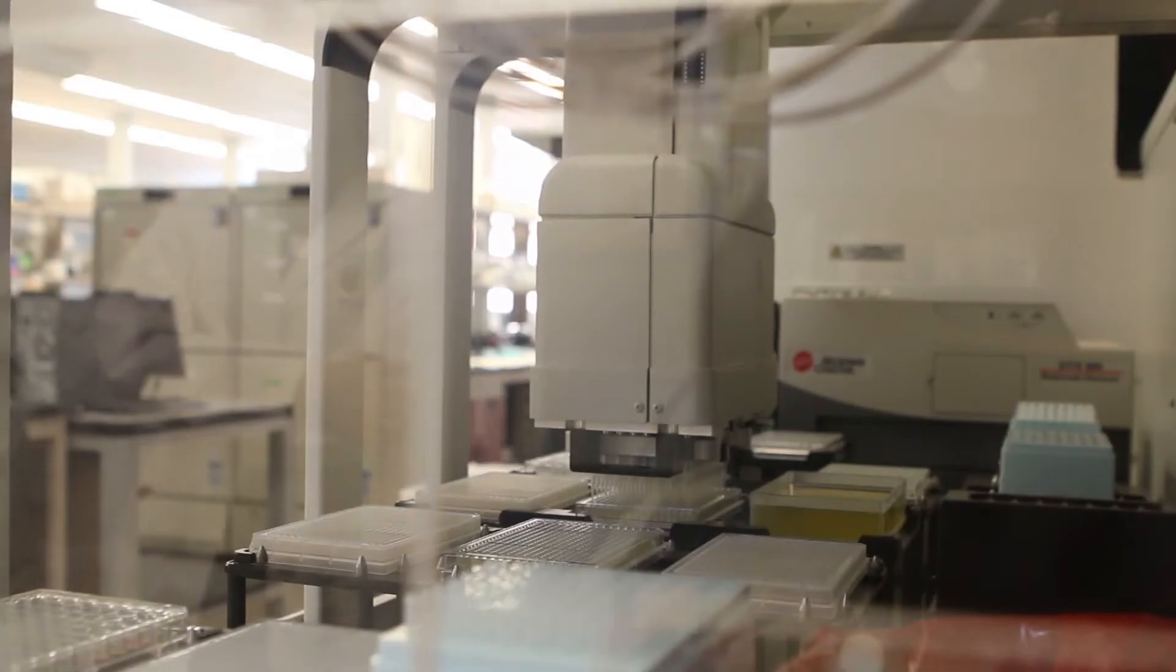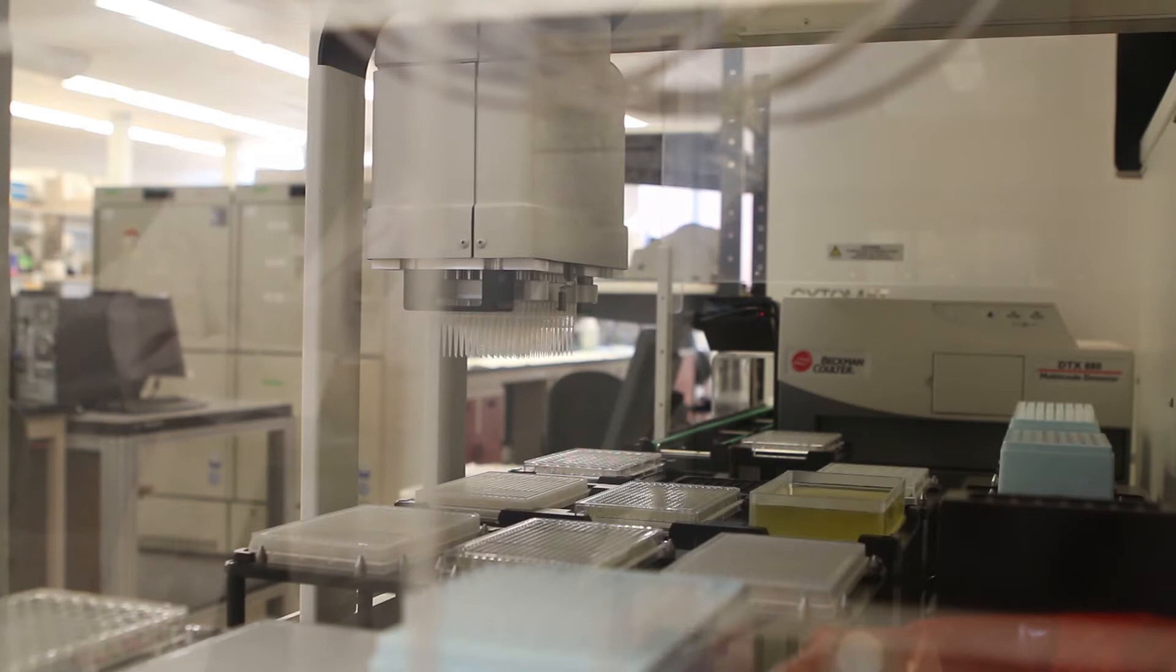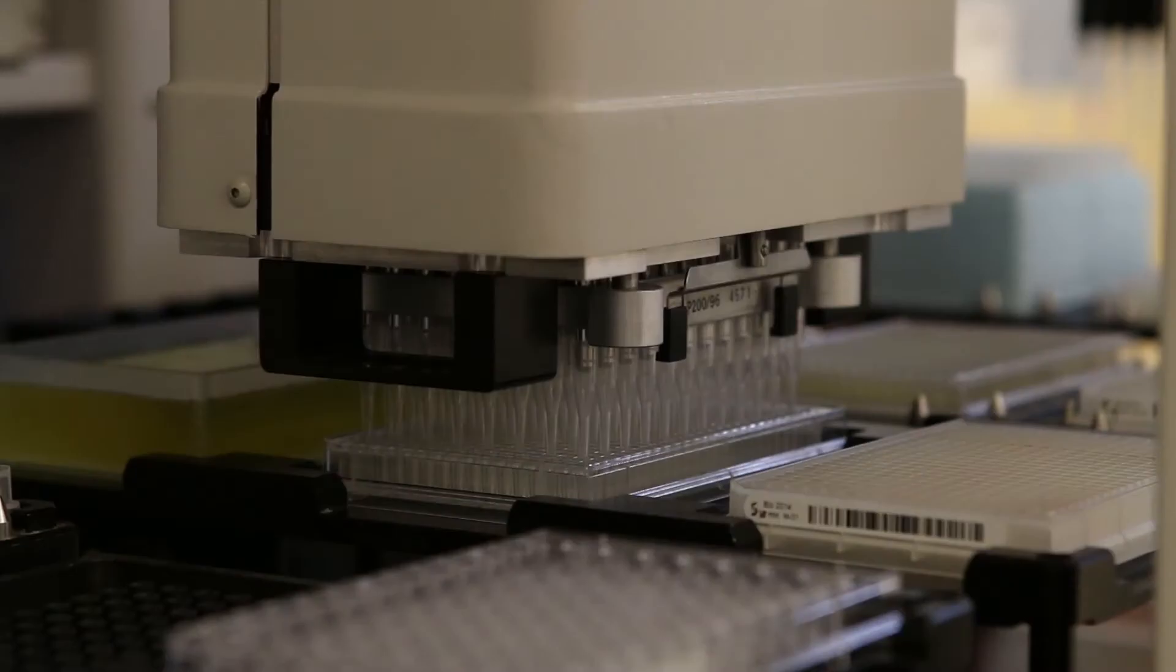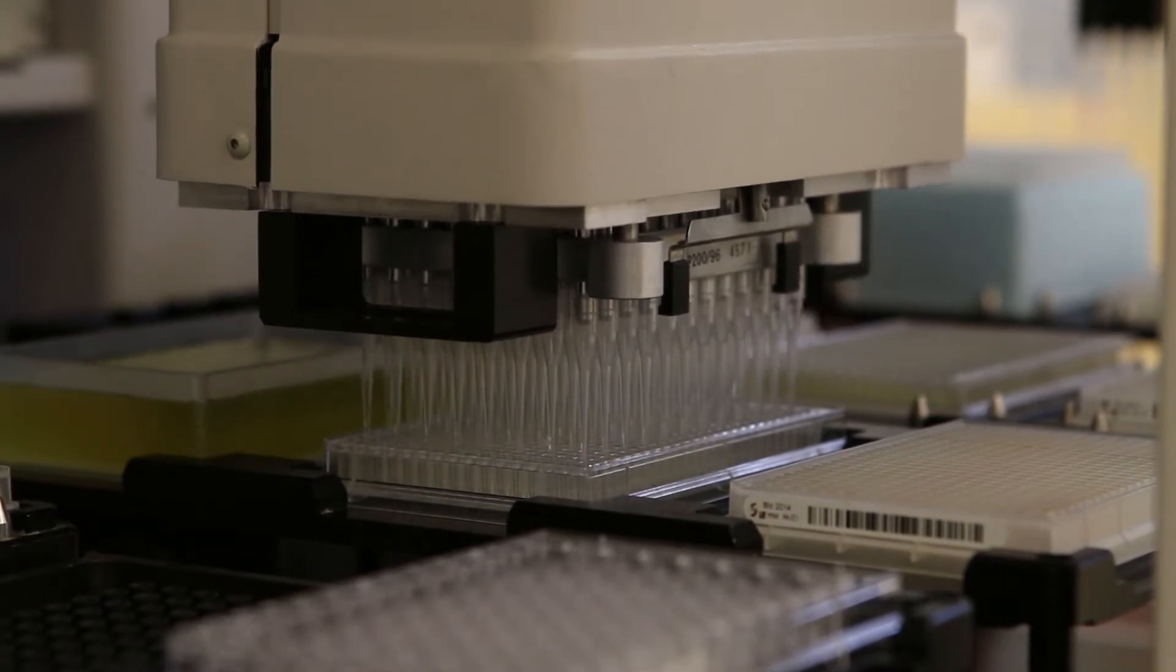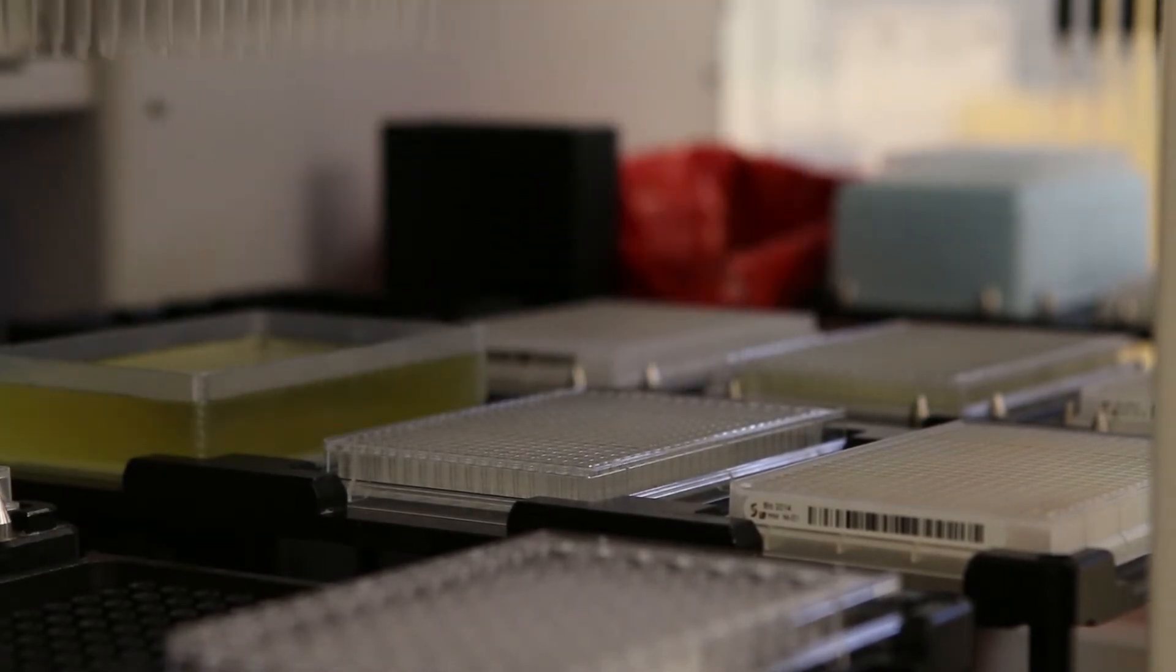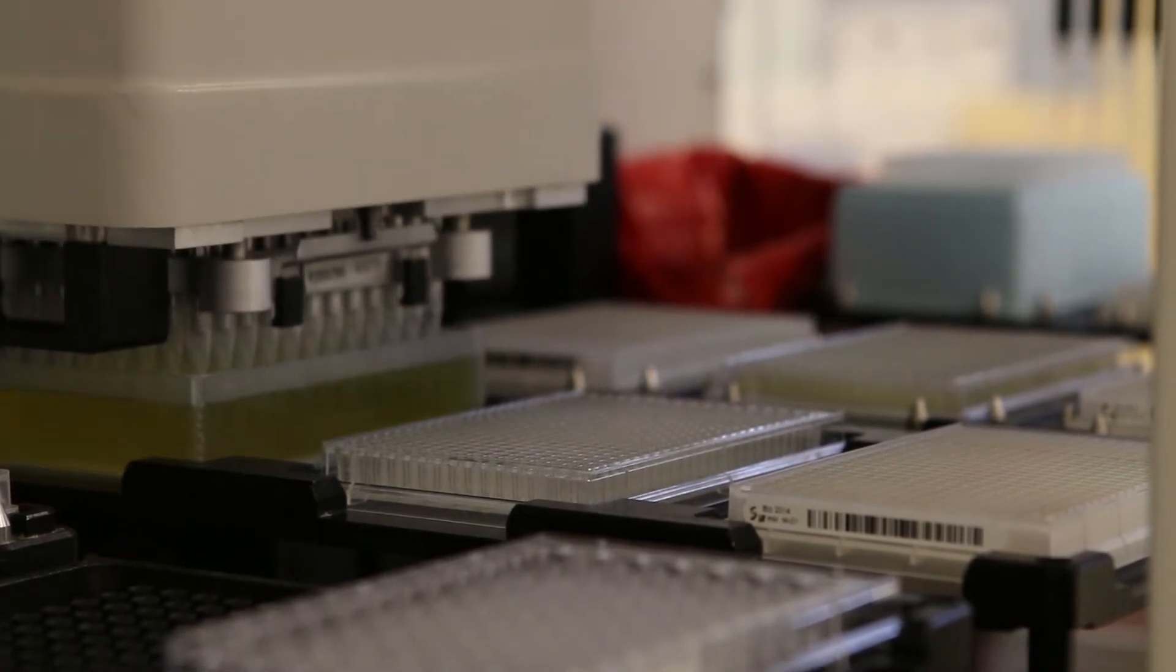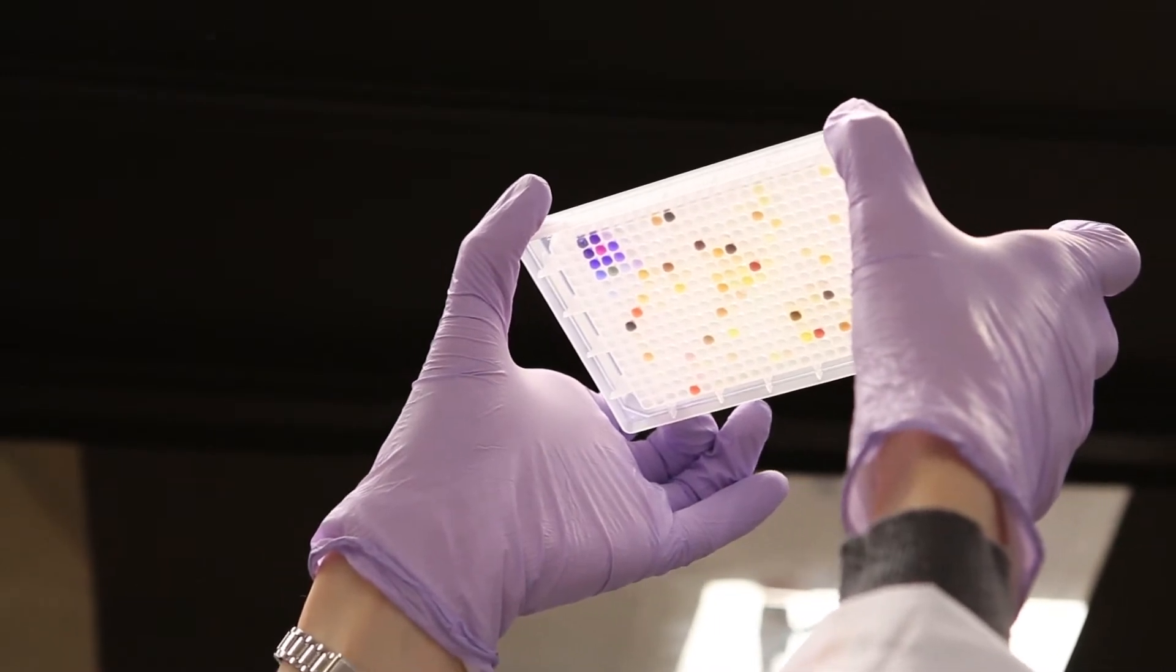In the high-throughput screening lab, we offer any sort of high-throughput project that might require automation of liquid handling. In particular, we have a focus on drug discovery type projects. We have half a million small molecule compound collection, which is the largest academic compound collection in Canada. Researchers have access to that library through us, and they can use that on our liquid handling instruments.